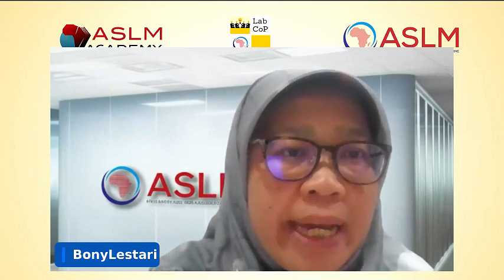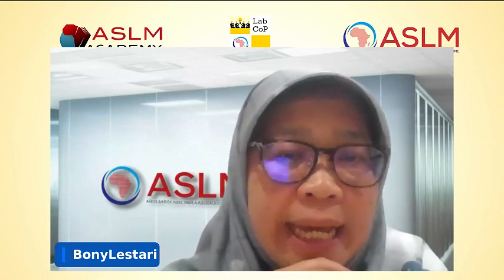Yeah. So currently at our lab, we don't have the ONT platform, doctor. We don't have that, but we now have the newest Illumina platform, the MiSeq i100, where they can run 48 samples with only 7 hours sequencing time. So this is also promising. And then I will do the unit cost calculation again.